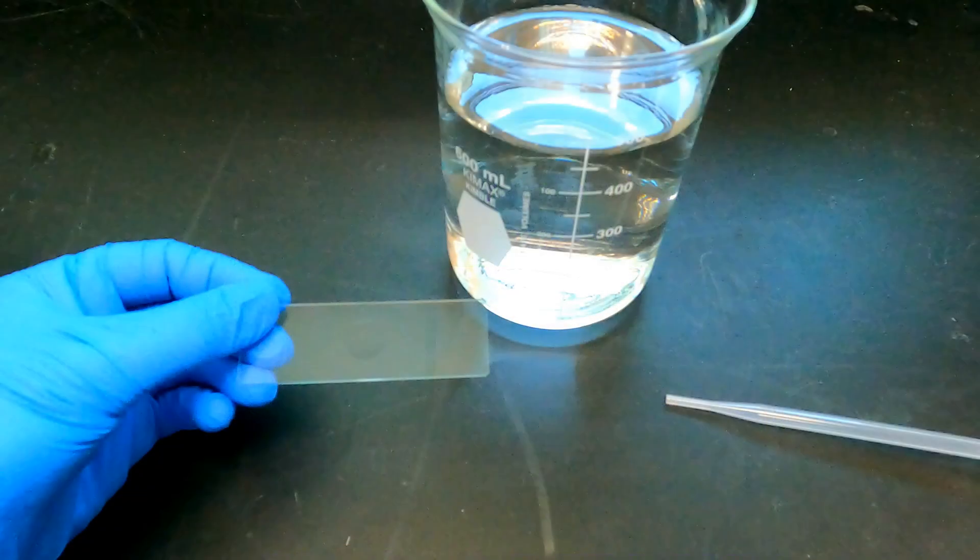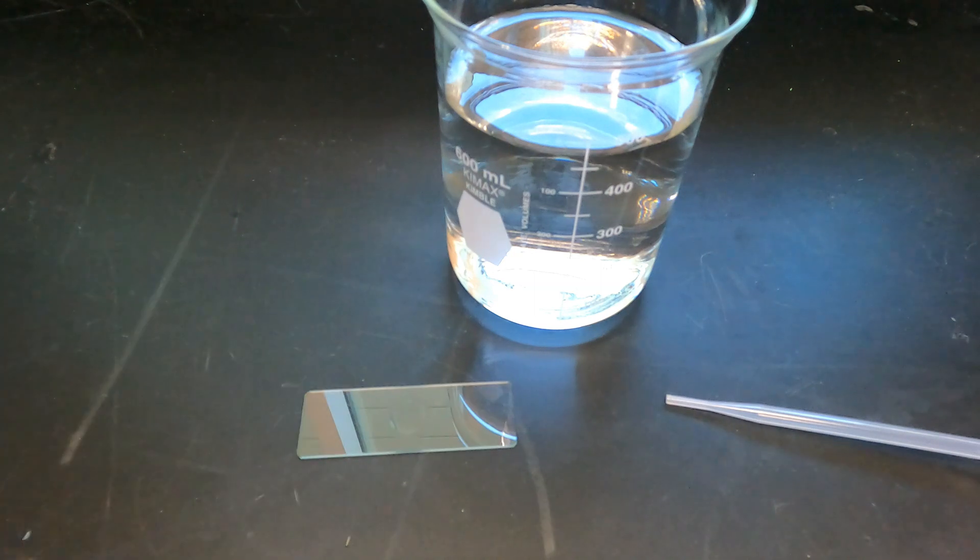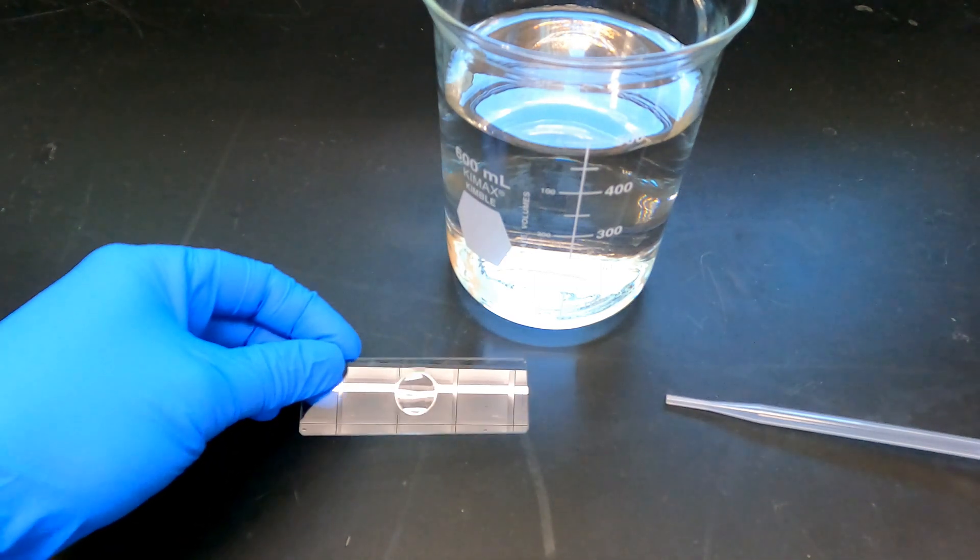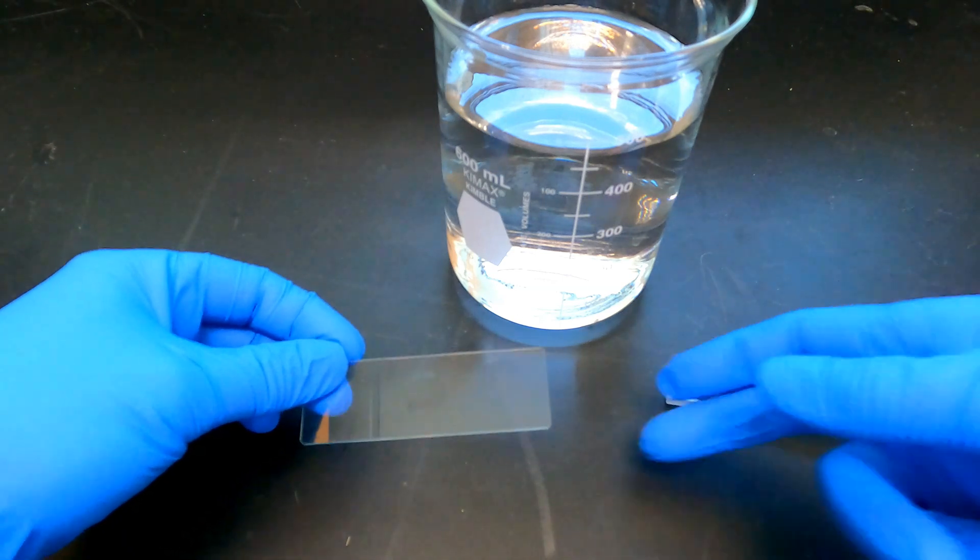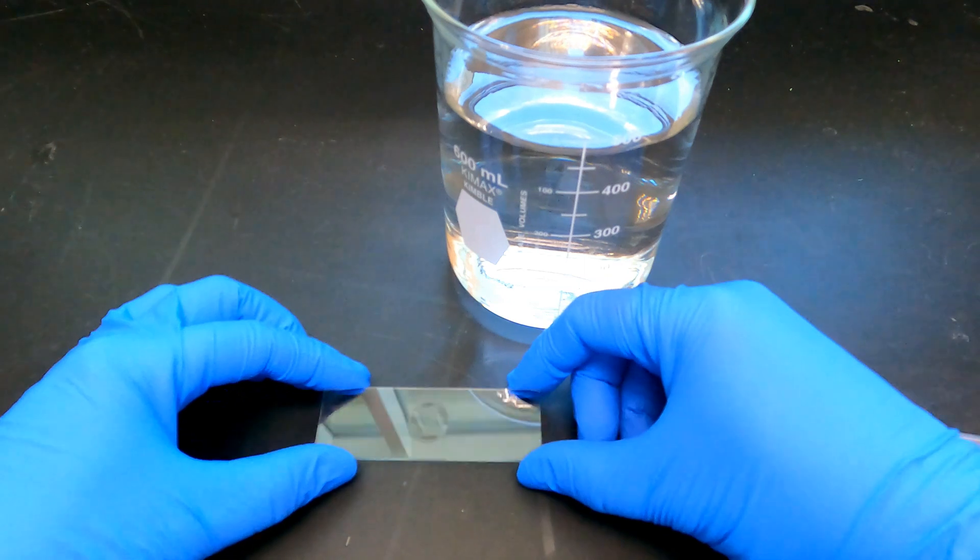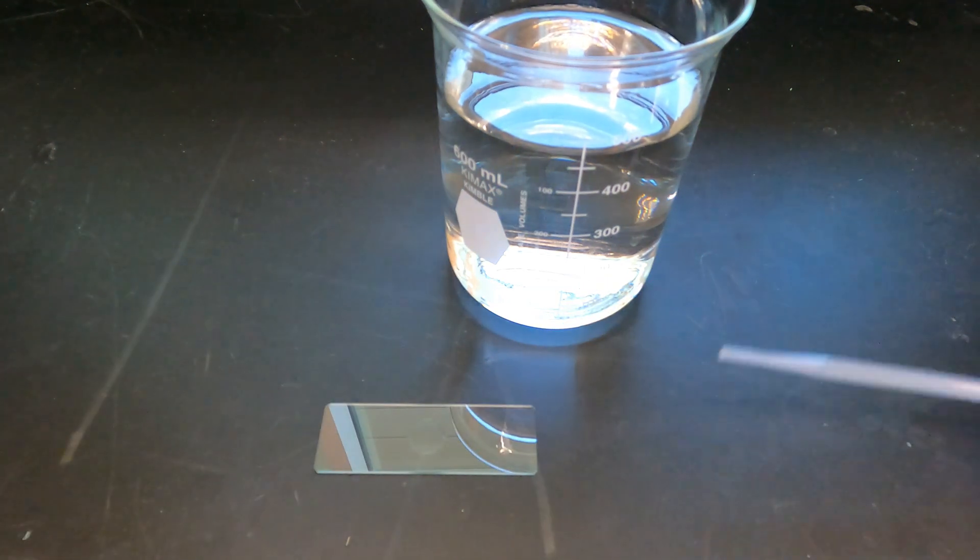First, you need to obtain a slide on which your Daphnia will rest as you view it under the microscope. Available slides in your lab may include simple flat microscope slides or, as in the case shown here, depression microscope slides. Depression microscope slides have a round depression or divot in the center of the slide. You can use your finger to determine which side of the slide the depression is on. Be sure to keep the depression on the top side.